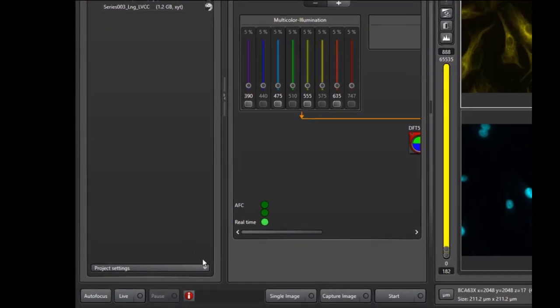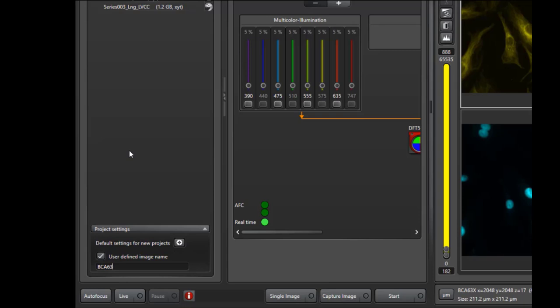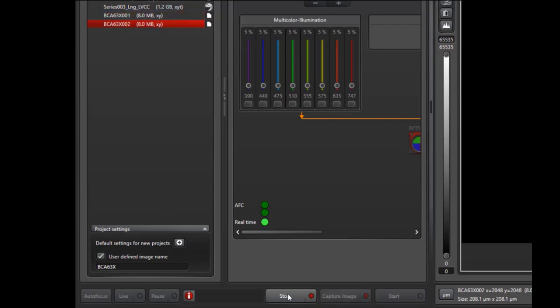Now we'll discuss the Project Settings tab here at the bottom. Here we can give newly acquired images a user-defined image name. For instance, if I call it BCA63X, just as before, and I acquire a new image, notice it names it with that prefix and 001 at the end. If I acquire an additional image, it names it sequentially.